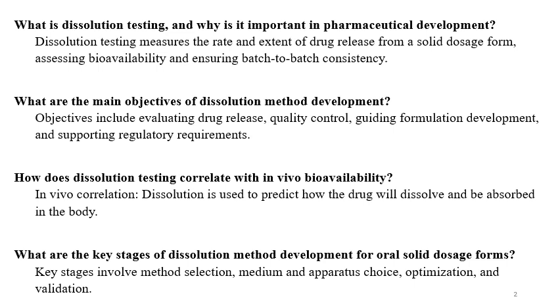How does dissolution testing correlate with in vivo bioavailability? There is a term called IVIVC, in vitro in vivo correlation. Dissolution is used to predict how the drug will dissolve and how the drug will be absorbed, and at what rate, into the body.